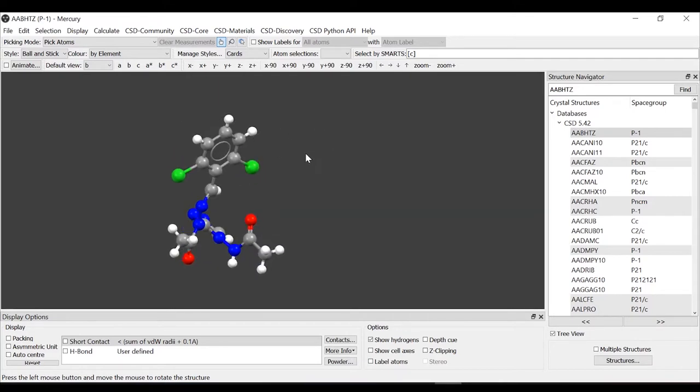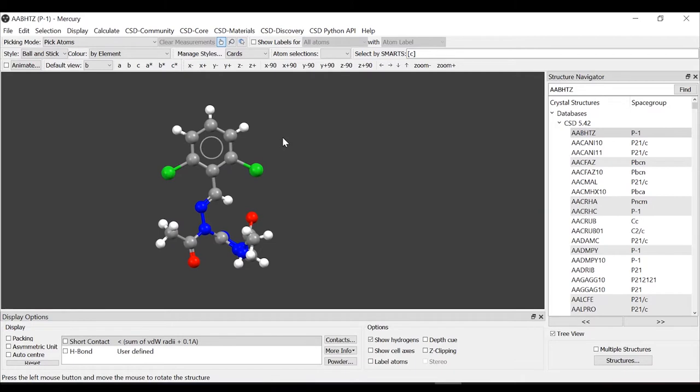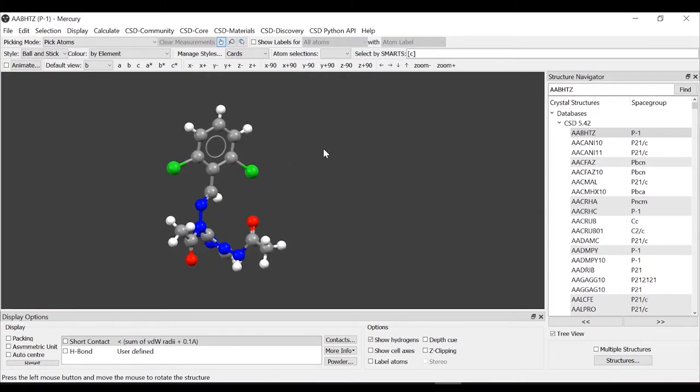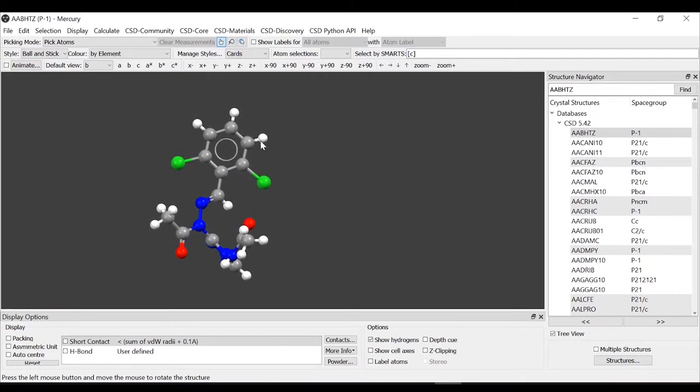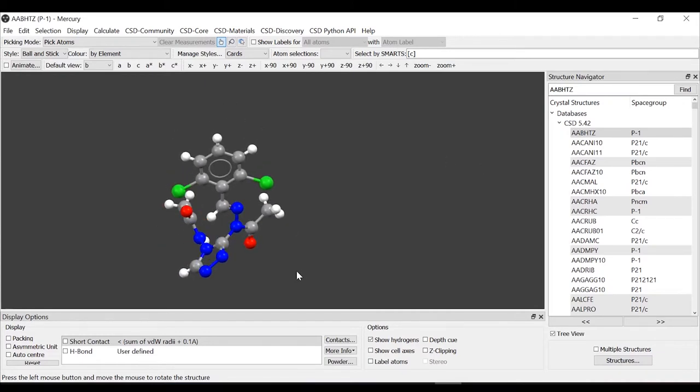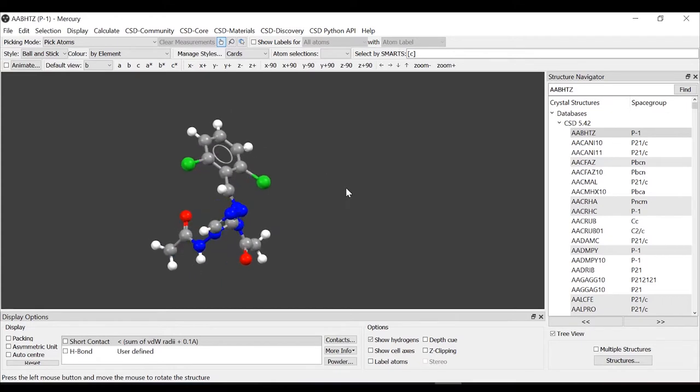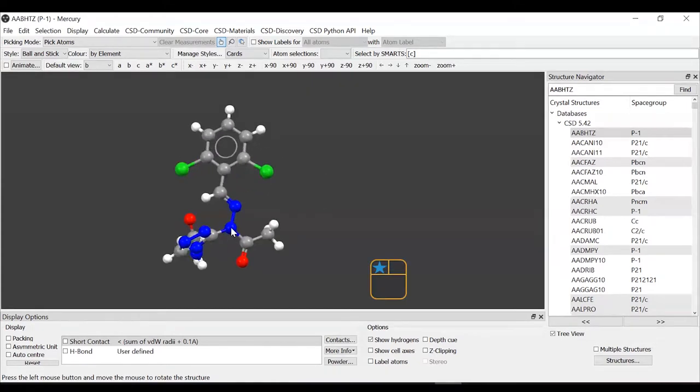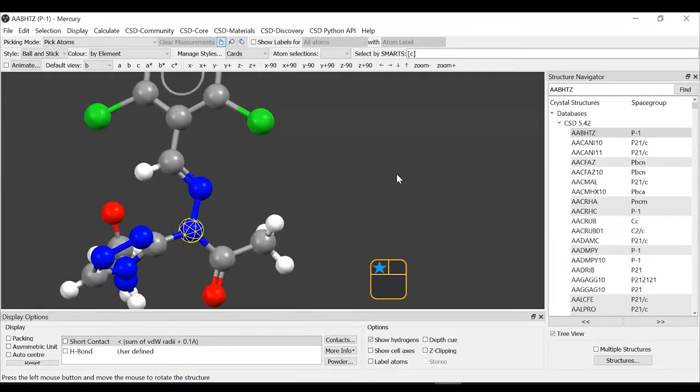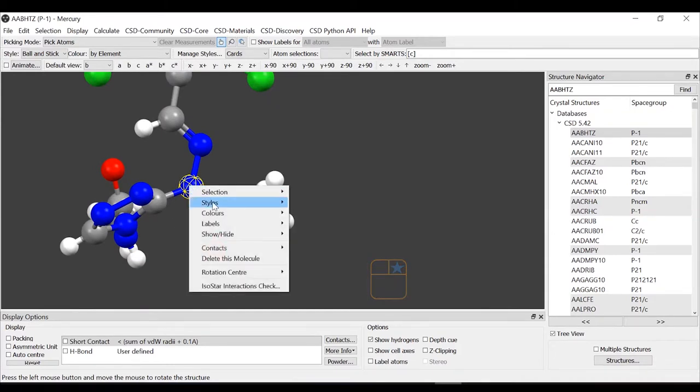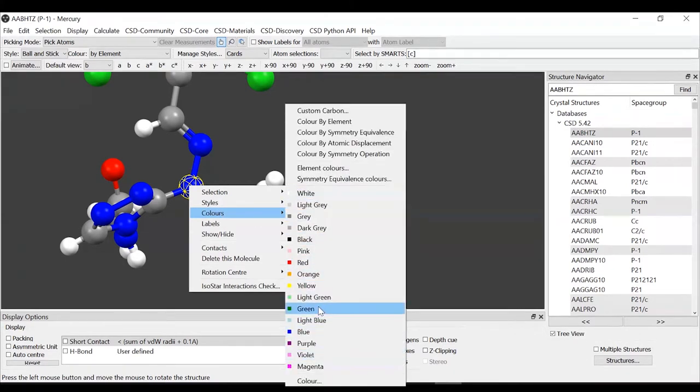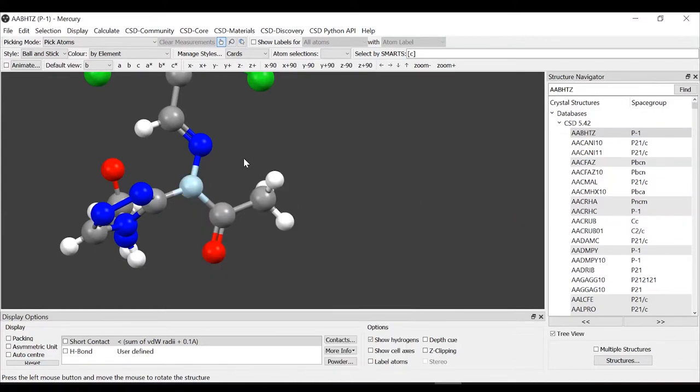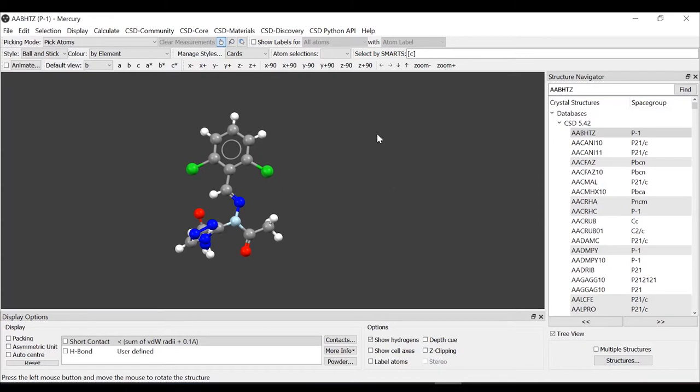Another thing we can change is the colors of individual atoms or of the elements. For example, we might want to highlight one of the nitrogen atoms. We can click on it and you can see that it is selected with a yellow mesh. Then we right click and we select colors. We can pick a color from the menu of colors here. Let's do it in light blue. We have changed the color of this individual atom.